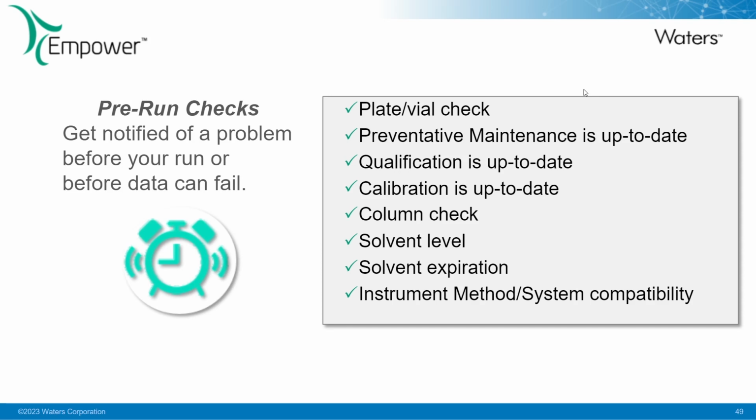Is the preventive maintenance up to date? Is the qualification up to date? Is the calibration up to date? If we've exceeded those dates, we don't want to collect data on that instrument.